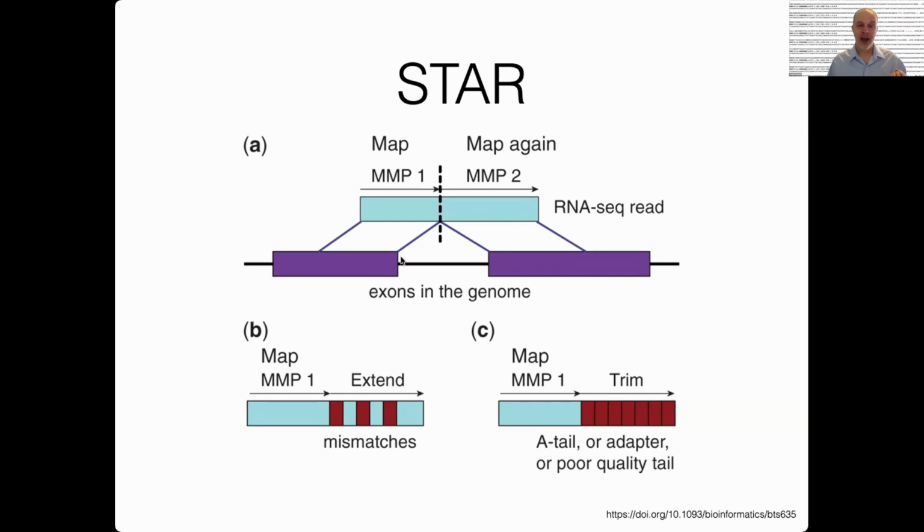look like, right? It's going to have this exon ligated directly onto this exon. And so if you try and map this fragment directly to the genome, the worst case scenario is that it won't match, especially if you use a really simple algorithm. It's not going to match because there's this big chunk of text in the middle here, that's the intron, that's not in the read, right?